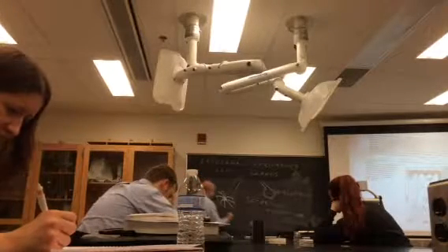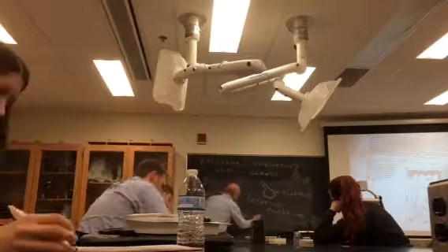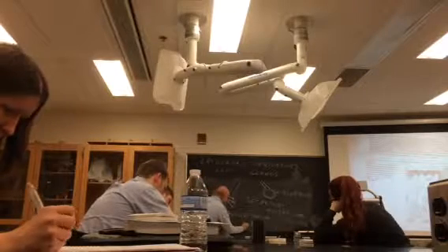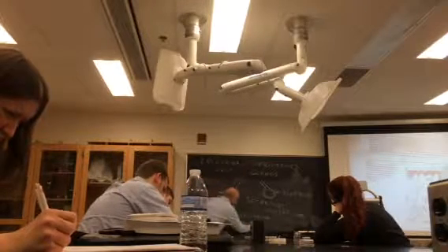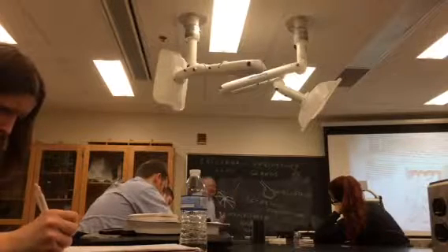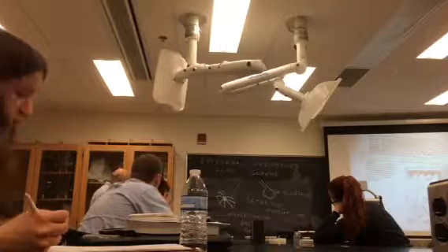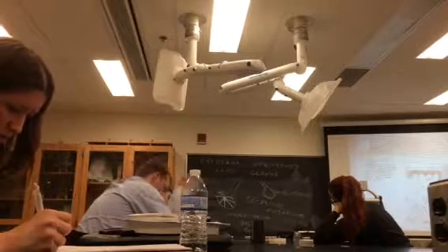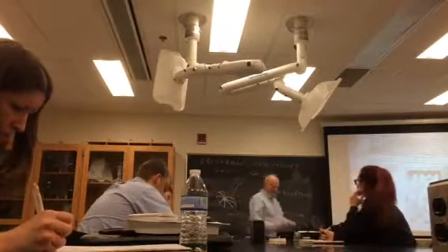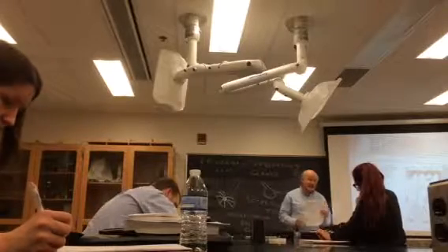That is called a myoepithelial basket cell. Basket, because it sort of looks like a wicker basket surrounding the alveolus. It is a smooth muscle cell, a particular kind of smooth muscle.